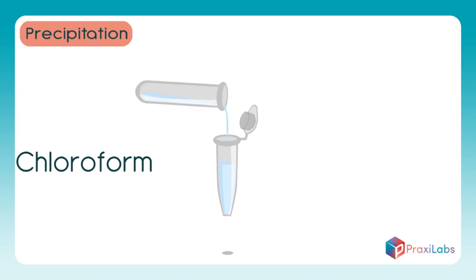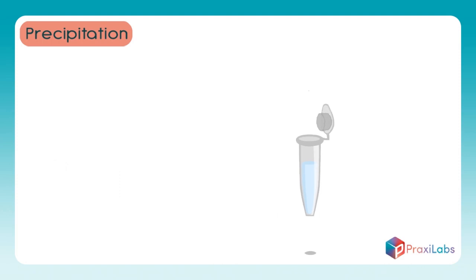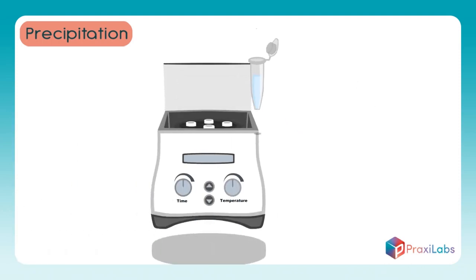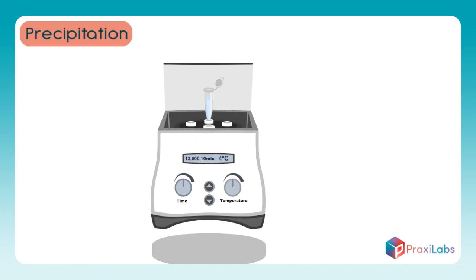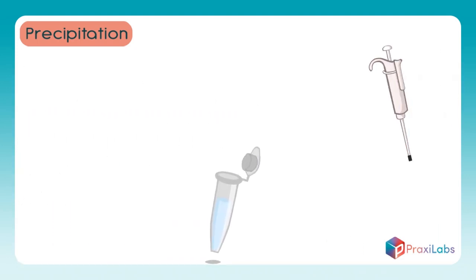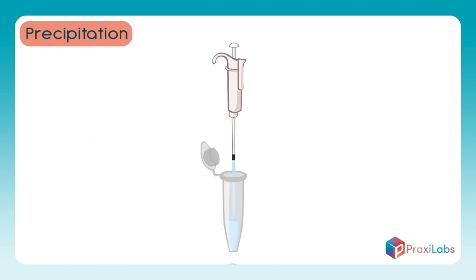Add 700 microliters of chloroform to the sample you have removed. Place the sample in the centrifuge and set it to 13,000 cycles per minute for 10 minutes at a temperature of 4 degrees centigrade to isolate the contents of the tube into 2 layers. Remove the top layer using the pipette, then place it in a clean tube.